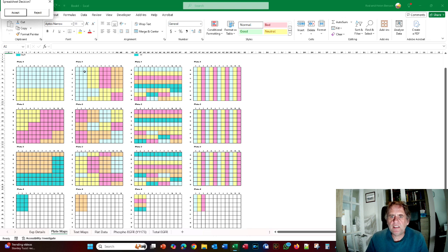So you can see that the top part is still exactly the same, but now what's happening is the subplating area of the bottom part is now coming into play. So the way the algorithm works is, remember, the areas we've defined were 3 columns by 5 rows. So it first of all plates this bit, then that bit, then that bit, then that bit, which was fine. But then it's got the leftover space. So what's the leftover space? Well, it's still 3 columns, but now it's only 3 rows because there's only 3 rows left.